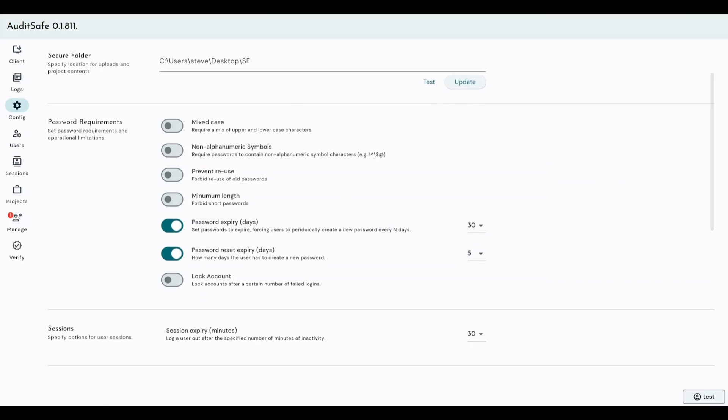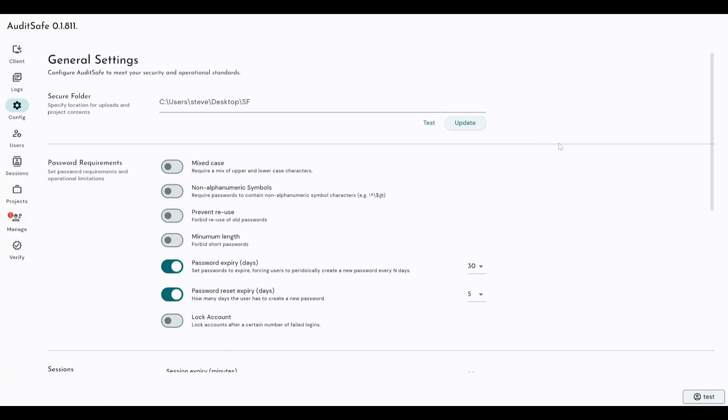This secure folder can be a local file or it can be a file folder based on a server or a VM. We don't lock that down in any way. So if you are an industry customer, you'll typically have your secure folder on a server, which is then regularly backed up to make sure that you are at minimal risk of data loss should anything happen to your site.